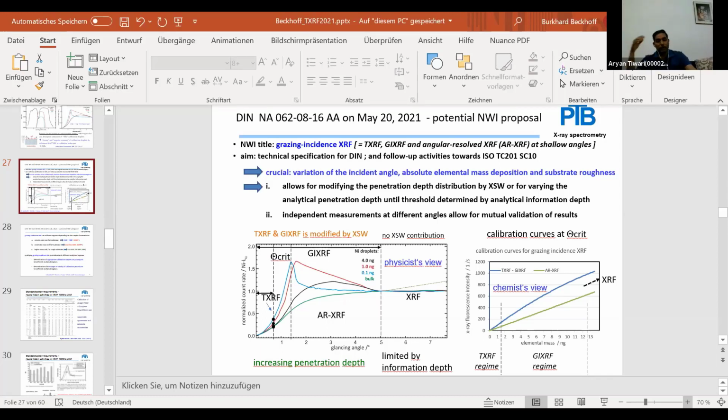Yeah, you're right. So I feel that this is not monodispersed. I think we have to take polydispersion, because we cannot take only one particle size. We should have a Gaussian distribution. We should take a Gaussian distribution profile, and then we try to fit. And I feel that we'll find a solution. This is what I am expecting. Yeah, you're right. And for polydispersed particles, let's say all these oscillations disappear.